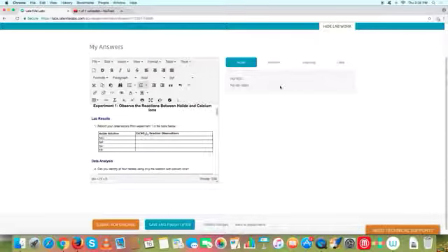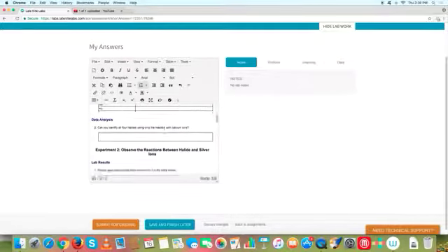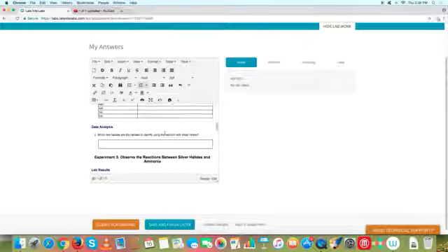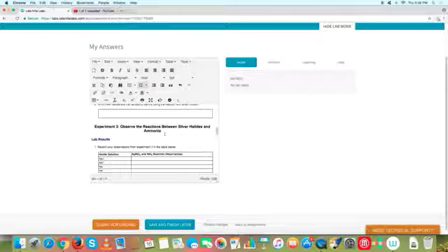All of your lab notes will be over here, and you'll be able to copy down what you saw as results for each of those. Be careful of those solids. Make sure you look closely at the test tube to ensure that you're seeing solids, and make sure you also record the colors of the solids. That's going to be important as well. Again, read through that background. Get an idea of what you're expecting to see for each of these ions before you actually do the lab, and it will go a whole lot easier for you, I promise you.